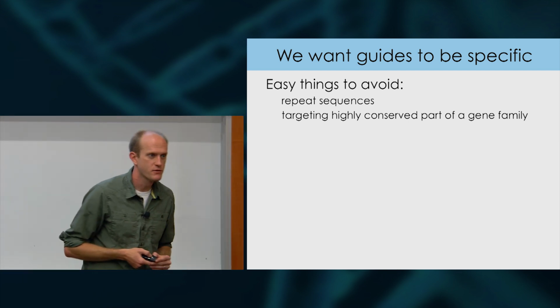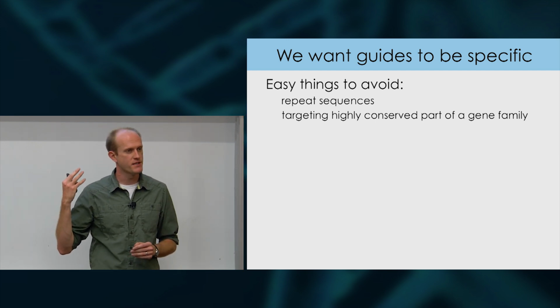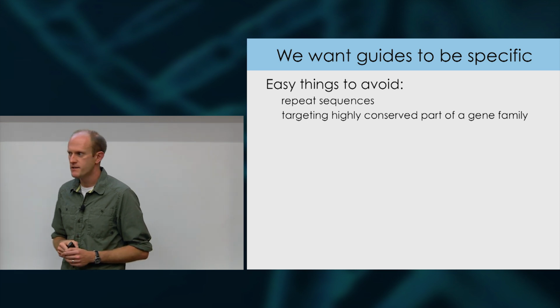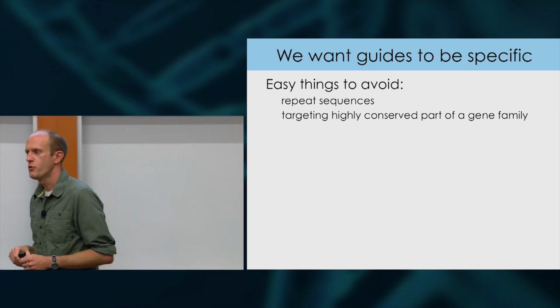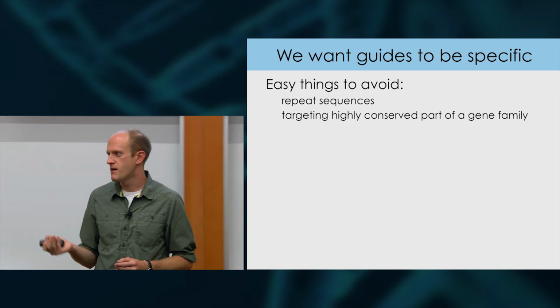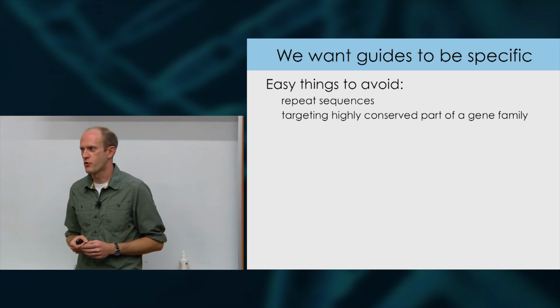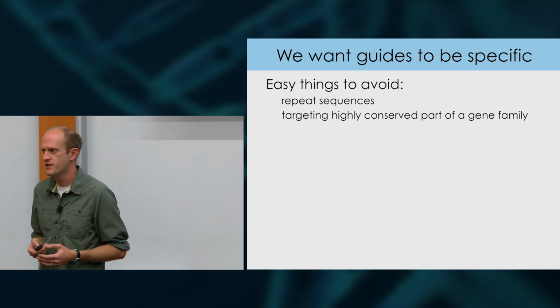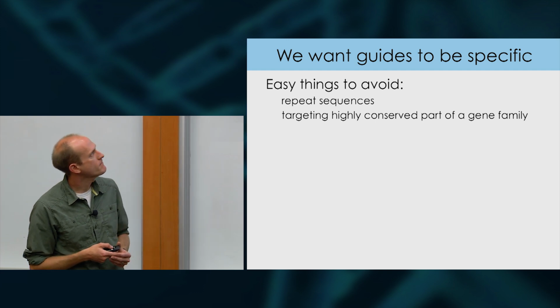Yep, that's absolutely possible. So some people have gone back and tried to take some of this sequence-based activity and then layer genome annotation on top of that. And as you might hear from Martin, that does seem to be the case for some things. Maybe I won't spoil the thunder, but there are certain annotations that correlate really well with binding sites in the genome.